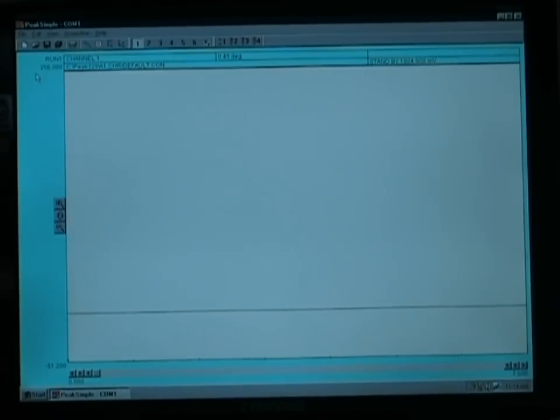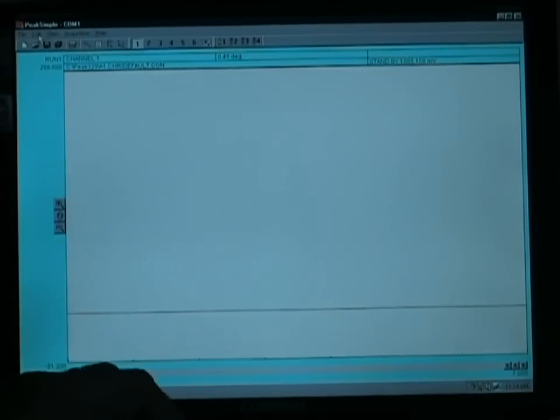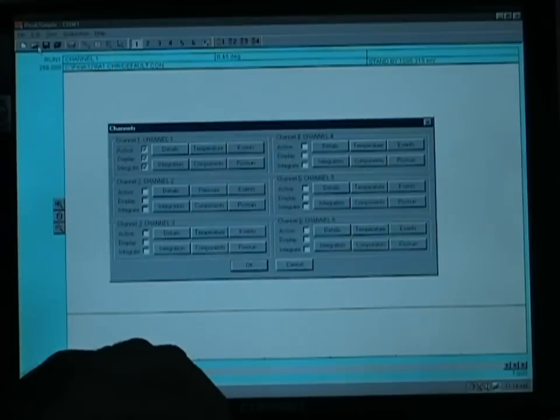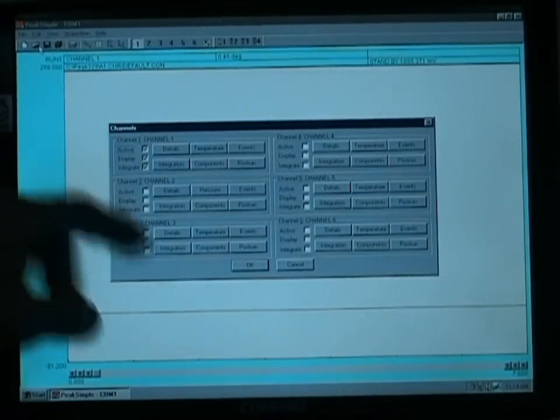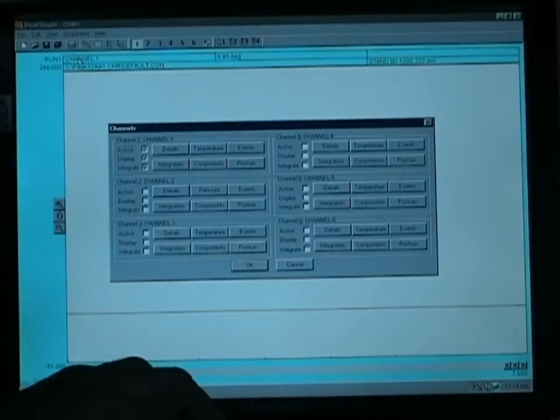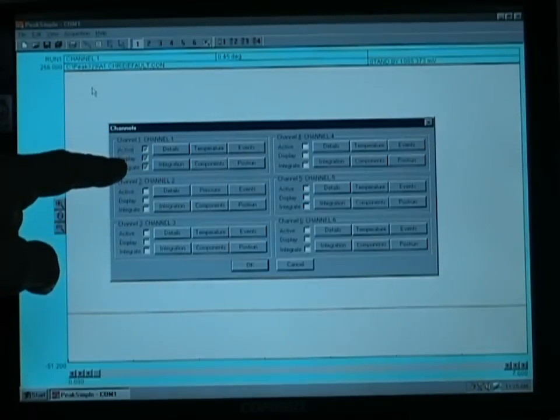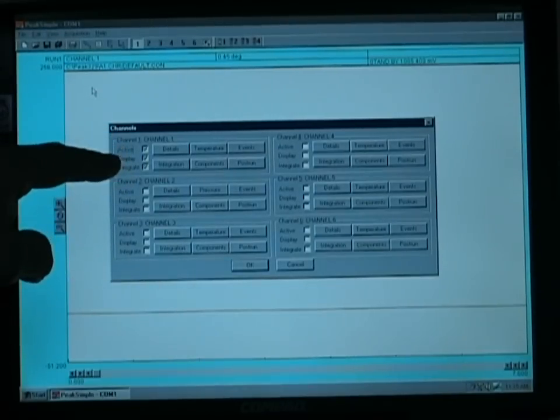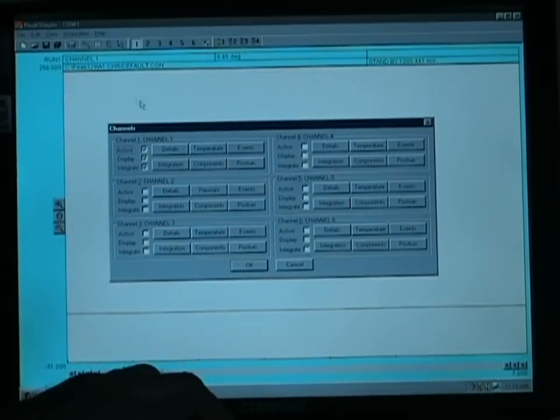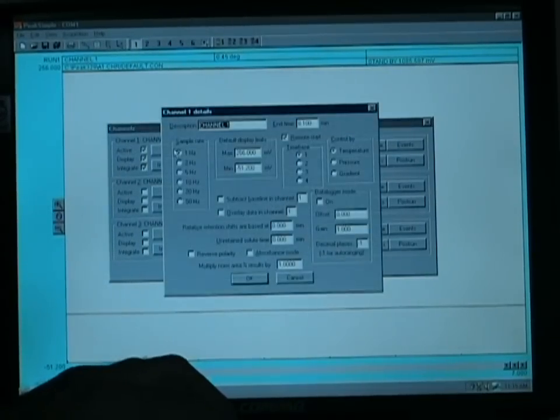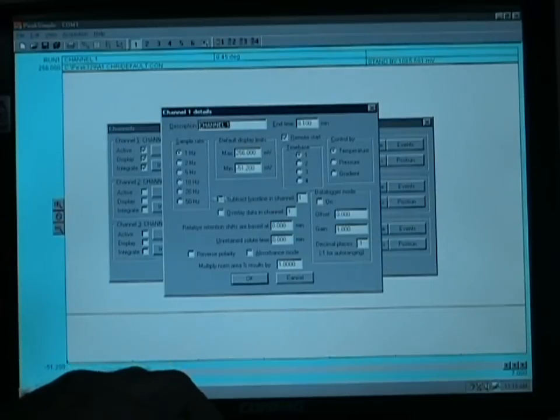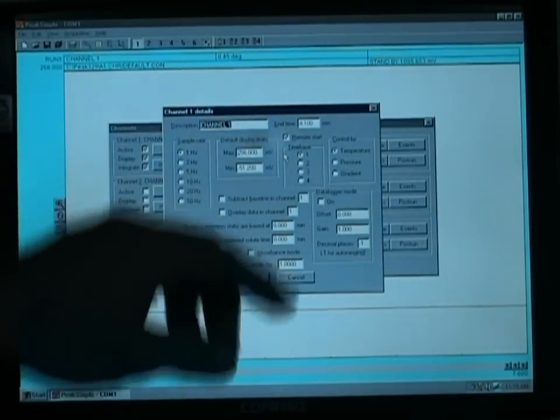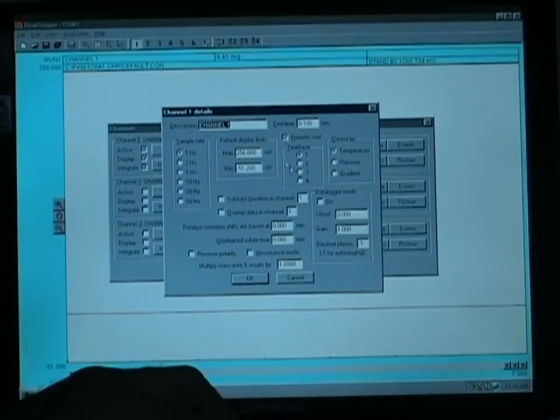With the peak simple software maximized on your screen, one of the first things you will do is set a temperature program for your separation. We click on Edit in the upper toolbar, go down to Channels, and with the AirGC system, Channel 1 is our active control channel. Make sure all three check marks are selected for active, display, and integrating. The Detail screen basically shows some defaults for display parameters, and the Remote Start should be clicked to allow you to start the GC from the push button on the instrument.